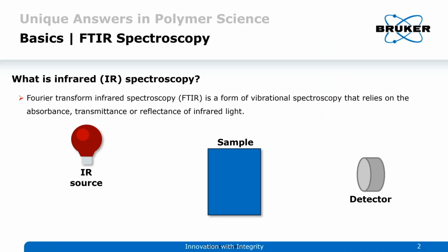When you have many tools at your disposal, as Lauren alluded to, when you're setting up an analytical lab, there are many different tools that you can use. If you want to do elemental analysis, you might want X-ray fluorescence. If you're doing analysis of unknowns, I would argue infrared spectroscopy is probably your first and best tool for looking at organics in particular. Amongst those many tools, infrared spectroscopy gives you the advantage that it's non-invasive and very highly specific.